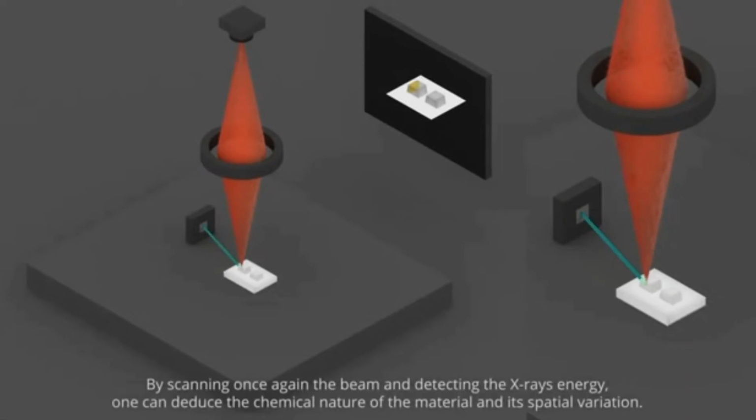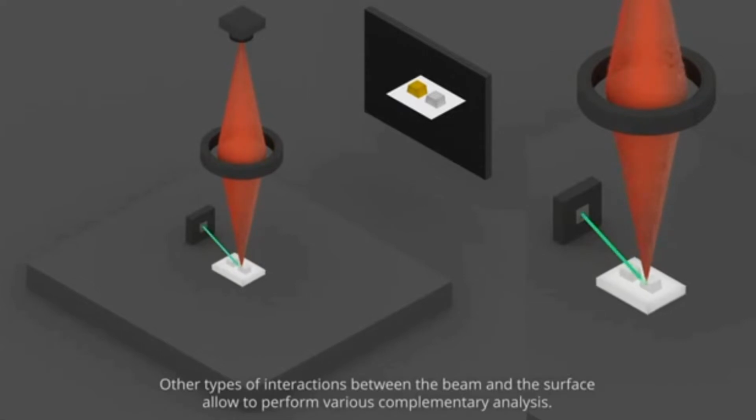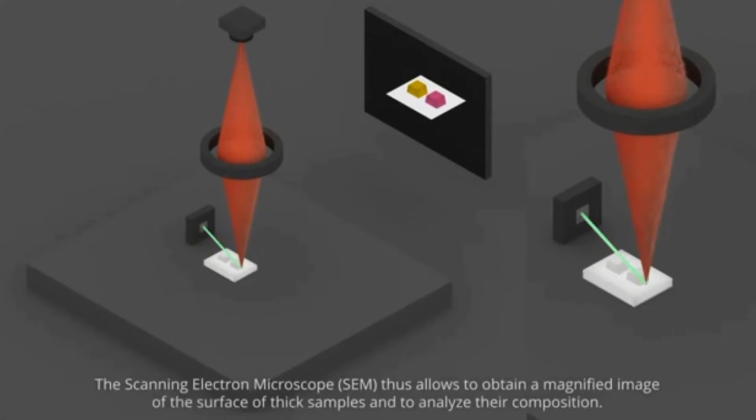By scanning the beam once again and detecting the X-ray energy, one can deduce the chemical nature of the material and its spatial variation. Other types of interaction between the beam and the surface allow various complementary analyses. The SEM allows one to obtain a magnified image of the surface of the sample and to analyze its composition.